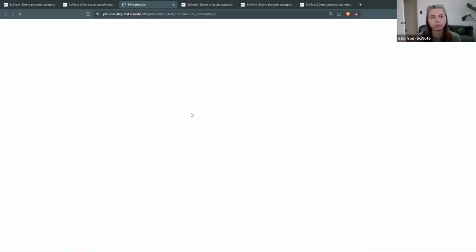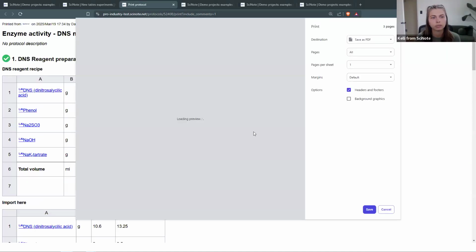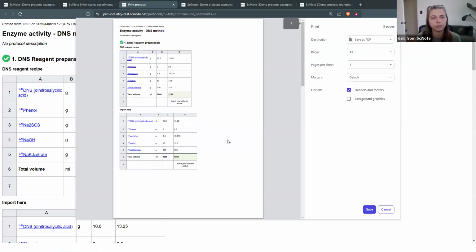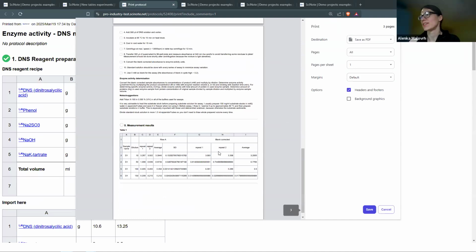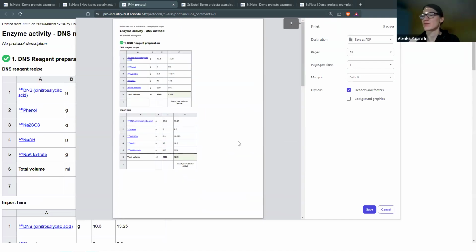Print preview. Yeah, as said, probably this one is more of an ideal use case because we have small tables. So that could be the issue that they are explaining.